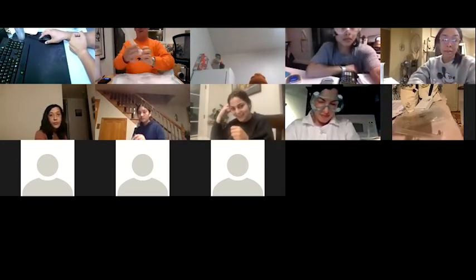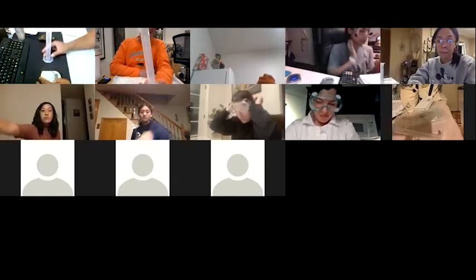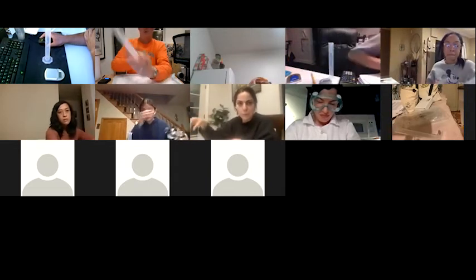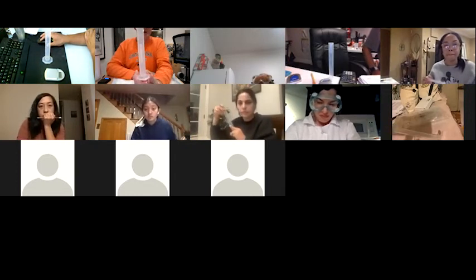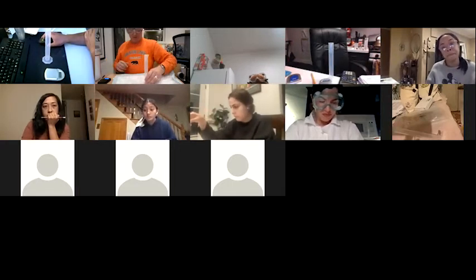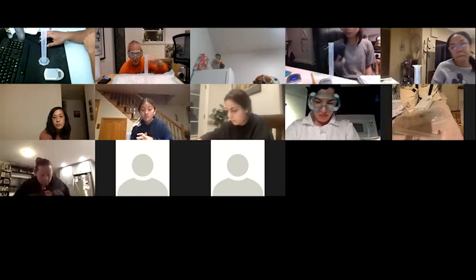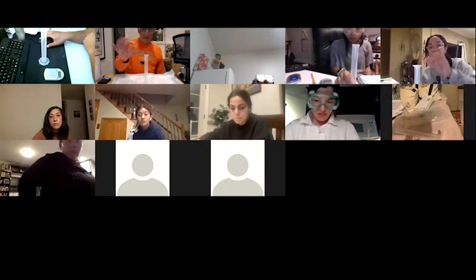So this is your 50 mil graduated cylinder. You can tell it's a 50 mil graduated cylinder because it says 50 on it. There's graduations and it's a cylinder. So there you go. So when you are measuring volumes with this, it is really important to get down to the level of where the graduations are. Because if you're looking from the top, you really can't tell what the volume is.